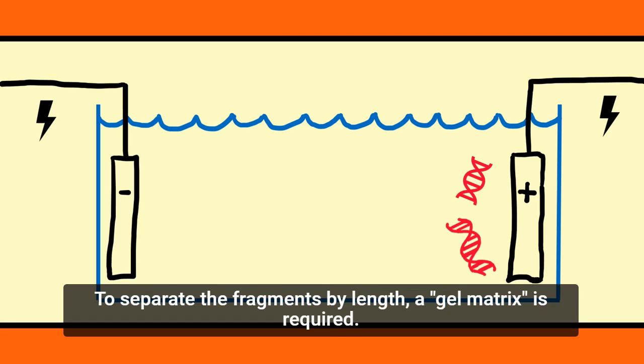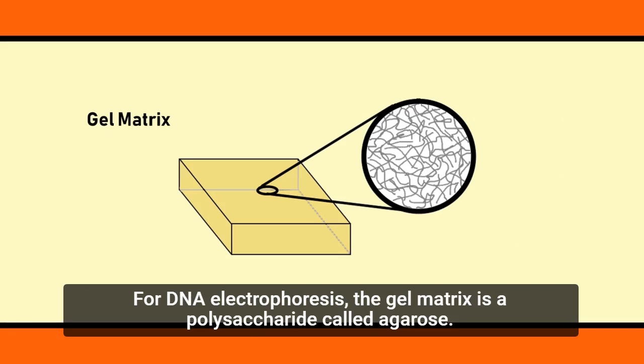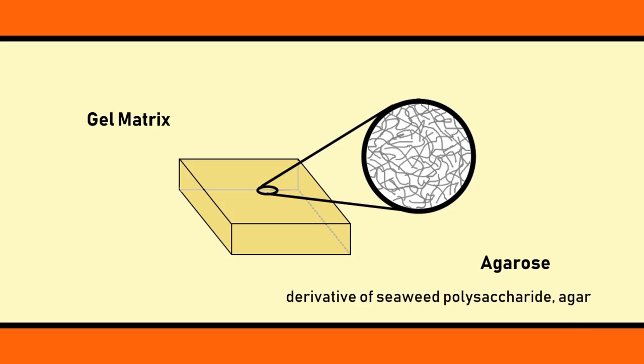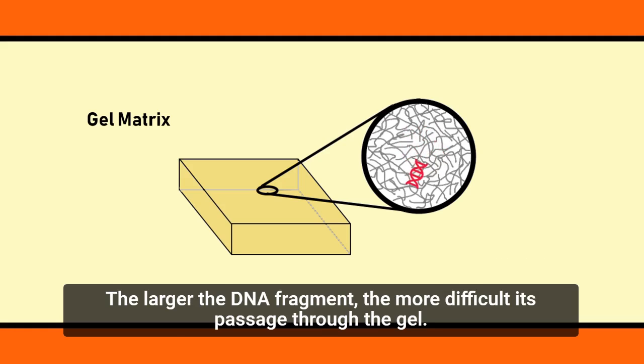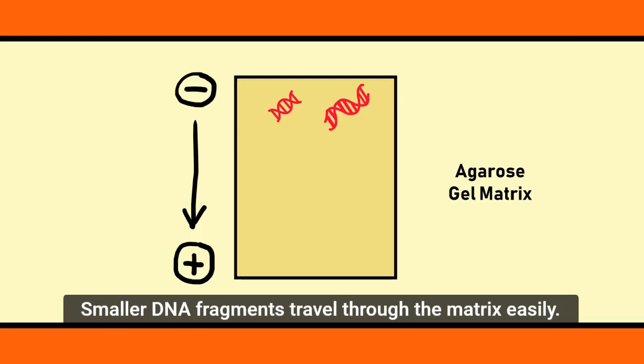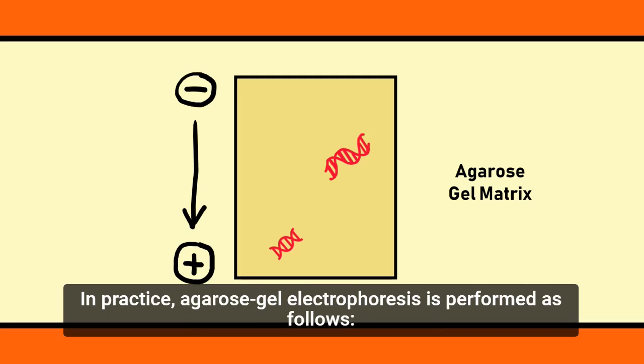To separate the fragments by length, a gel matrix is required. A gel matrix is a cross-linked substance that acts like a molecular sieve. For DNA electrophoresis, the gel matrix is a polysaccharide called agarose. The purpose of the agarose is to impede the migration of the DNA molecules. The larger the DNA fragment, the more difficult its passage through the gel. Smaller DNA fragments travel through the agarose matrix easily. Therefore, in a given time, small DNA fragments travel farther than larger DNA molecules.